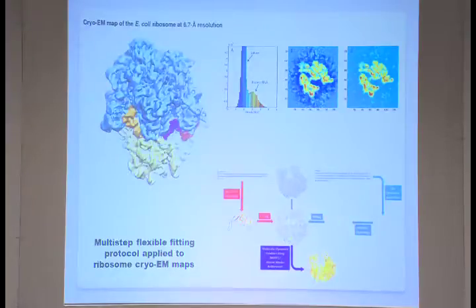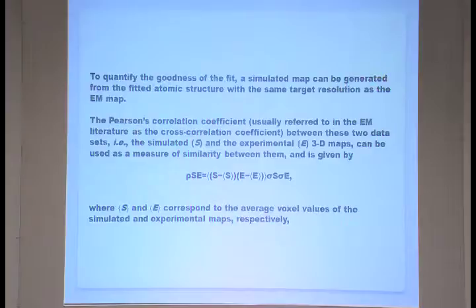So you have to do a rigid body, or manually in Chimera, PyMol, anywhere you can put one onto another, and then you can start the fitting, and each of the proteins and RNA you can fit step by step. The quality of the fitting is assessed by the cross correlation, and the best cross correlation is a similar way for most of these methods.